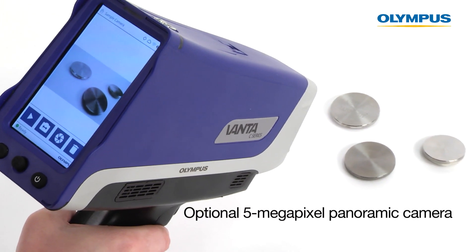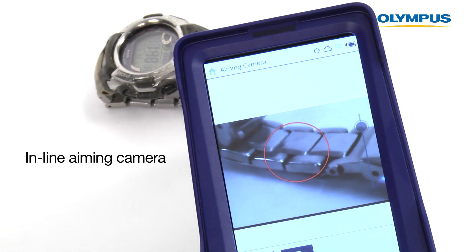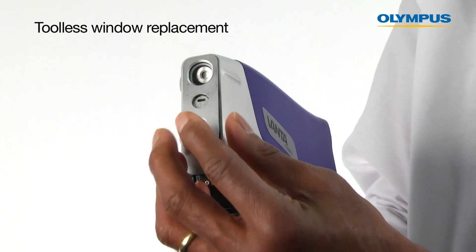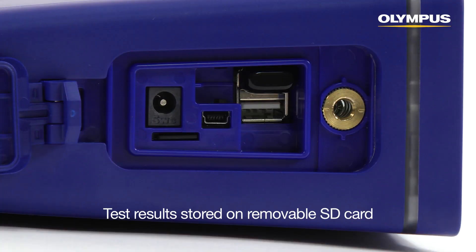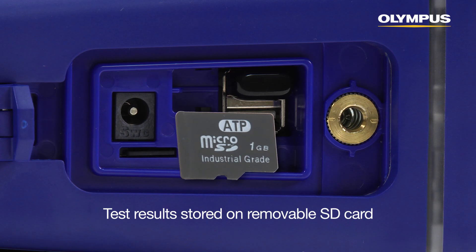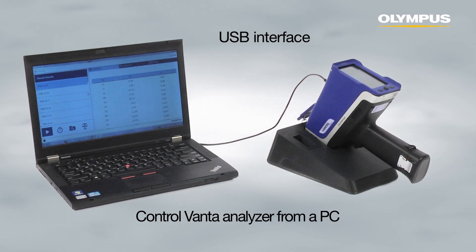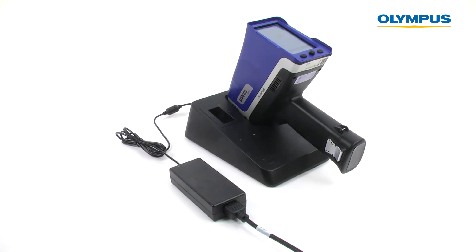An optional 5 megapixel panoramic camera and an inline aiming camera record images of each test for comprehensive record keeping. Users can hot swap batteries for maximum uptime and productivity. Vanta analyzers have measurement windows that can be easily replaced without using tools. Test results are stored on an easily accessible, removable SD card. The USB interface port enables direct downloads or seamless control of your analyzer from a PC. Every Vanta comes with a docking station that charges the analyzer's battery as well as a spare battery.